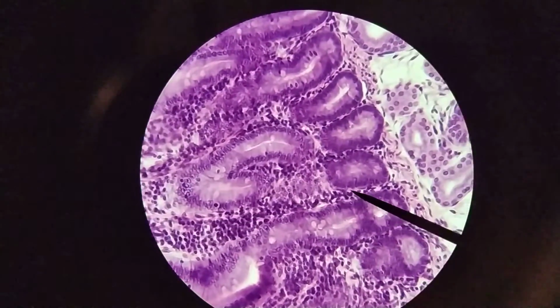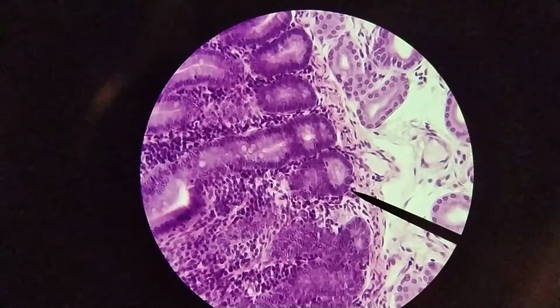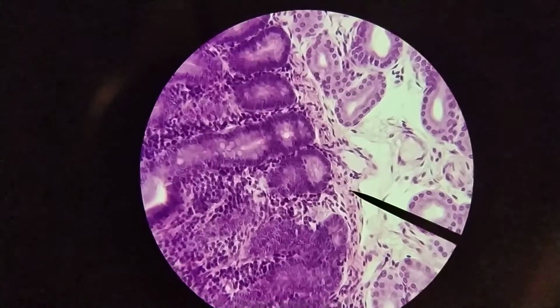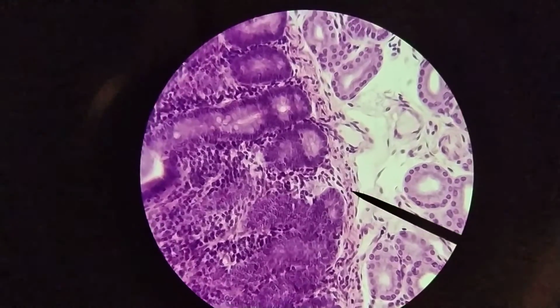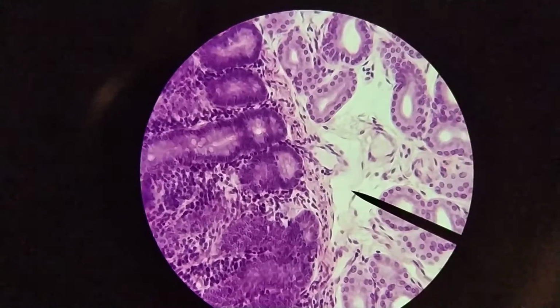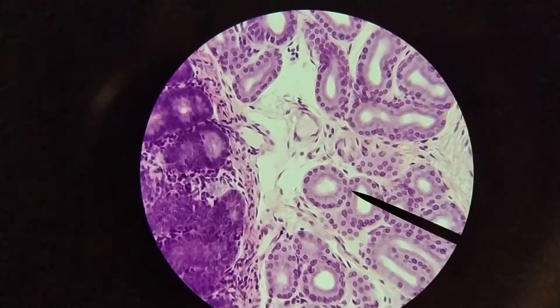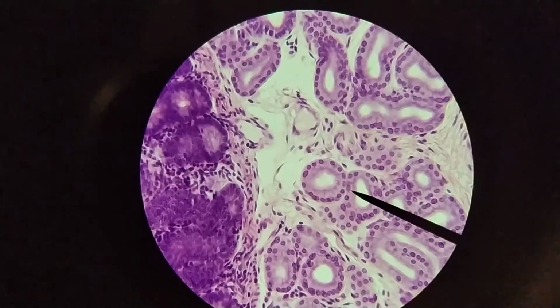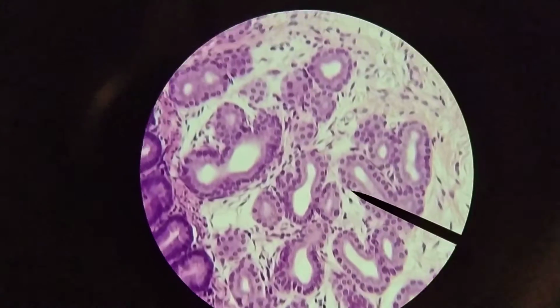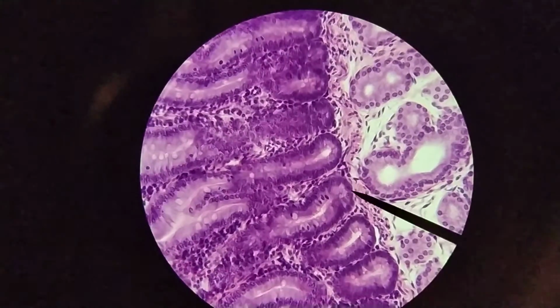Now beyond this, we have muscularis mucosa, which is not very prominent here, at least not in this slide, but there's a muscularis mucosa here. And then beyond that, we have a tunica submucosa with duodenal glands or Brunner's glands. And so these would open up into the bases of these crypts.